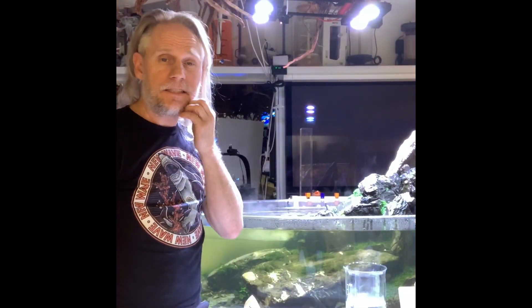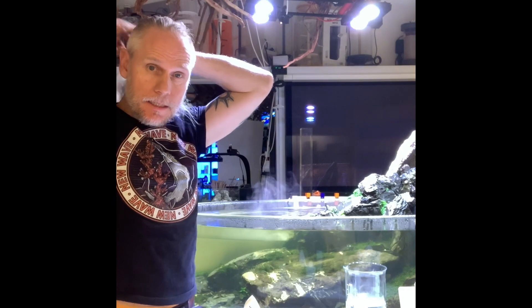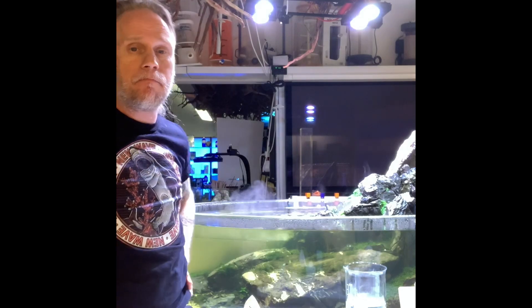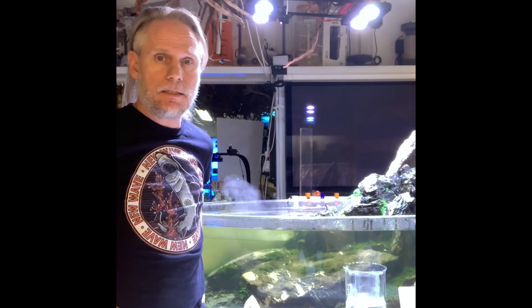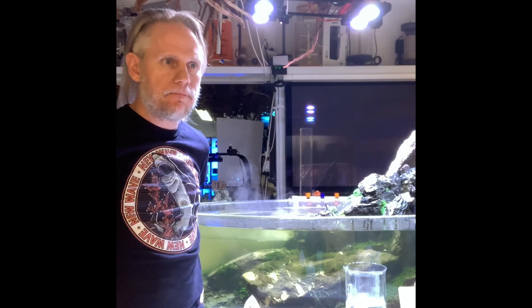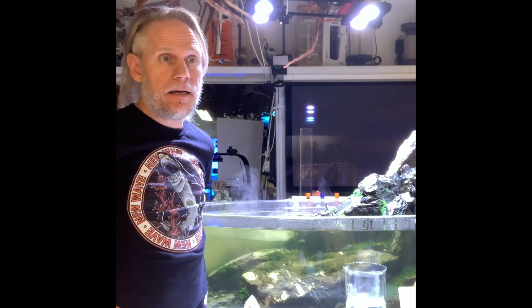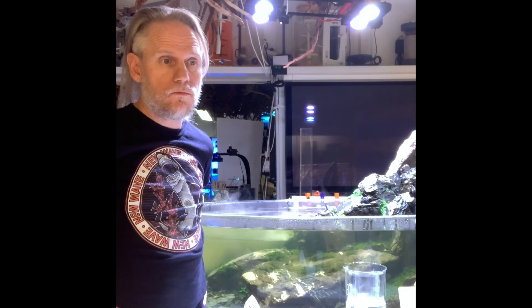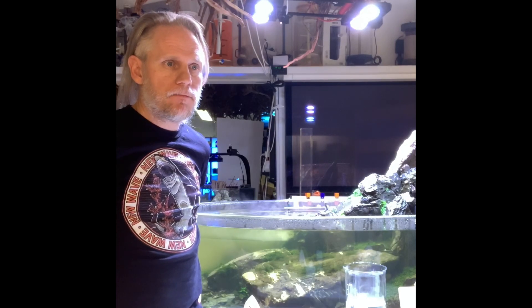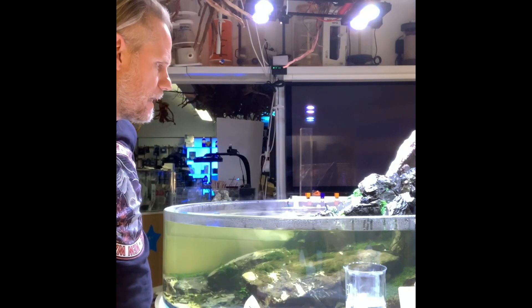Today we're going to do a test — we're going to measure the color of the water. Water color is measured in PCU, platinum cobalt units. A clear water lake with especially clear water is about 10 PCU or less, and that's what we're going to target here.